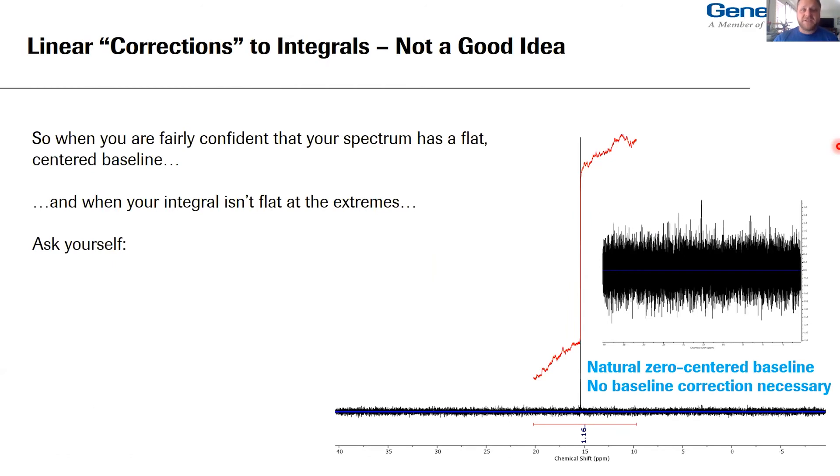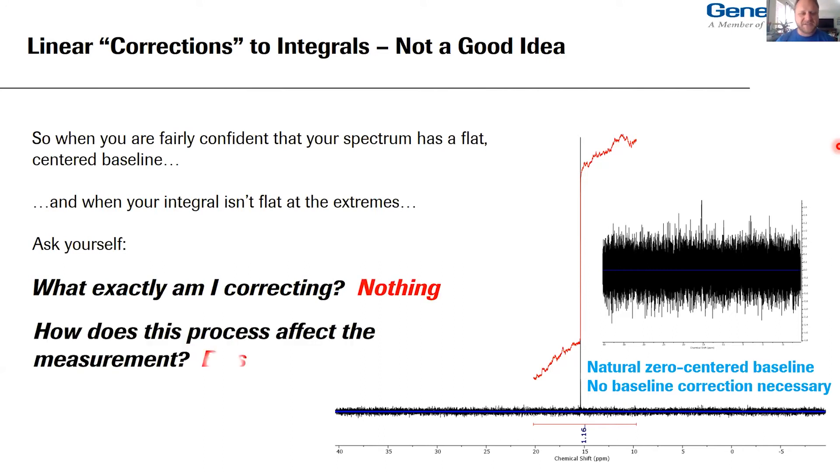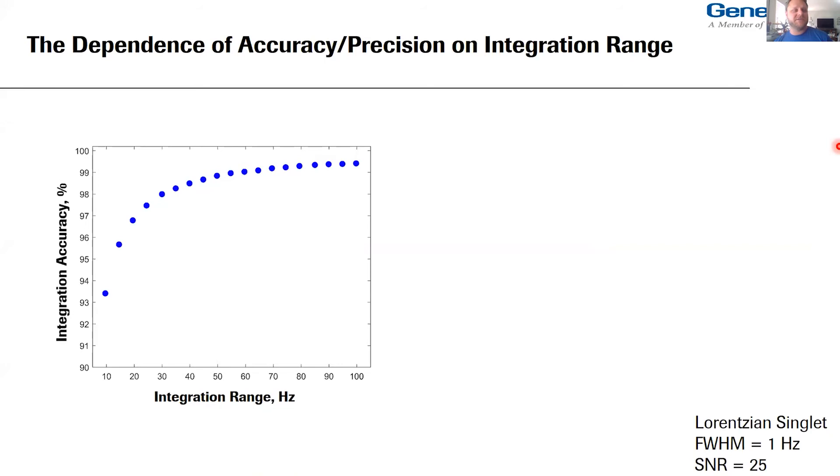Baseline correction should only be performed visually and very, very conservatively, because it is a very easy way to introduce unintended and unnecessary bias into your measurement. Linear corrections to integrals are not a very good idea. When you're fairly confident your spectrum has a flat and centered baseline and your integral isn't flat at the extremes, just ask yourself: what am I correcting? — nothing — and how does this affect my measurement? — you're biasing it. These effects are even more exacerbated when dealing with broad signals.